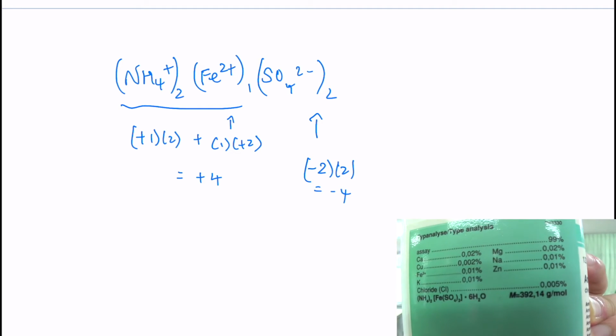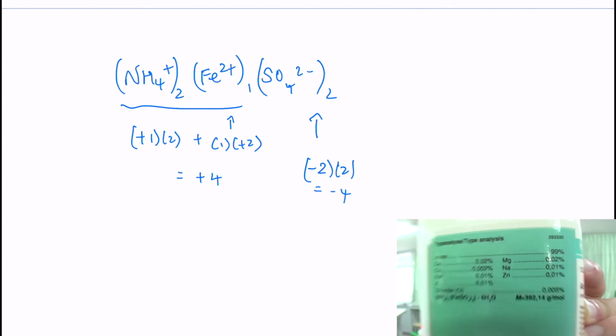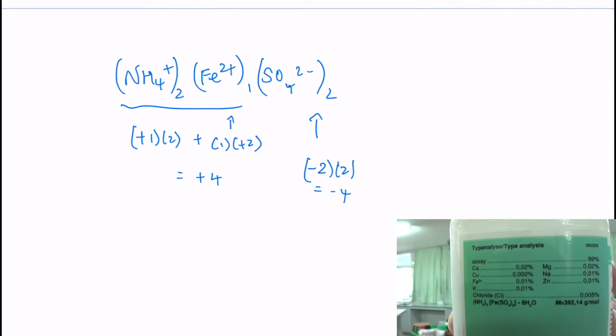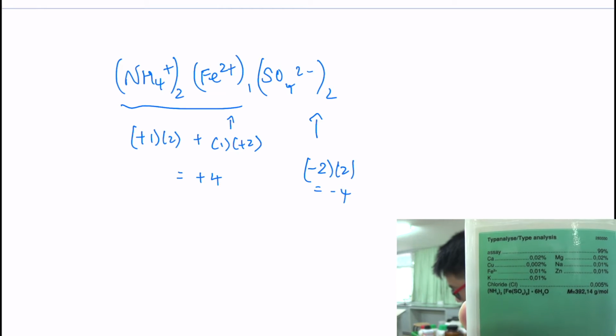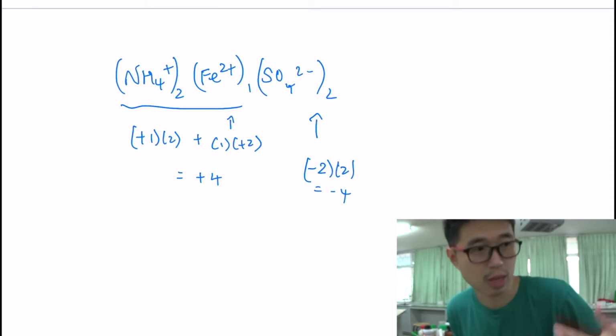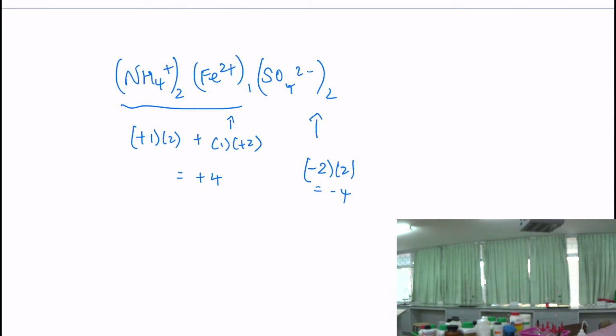There's also a thing given there, which is, I don't know if they give you, molecular weight. The one at the bottom right hand side there, you see around 300 and something. So I'm just going to show you using my very primitive periodic table. I'm just going to go grab it.